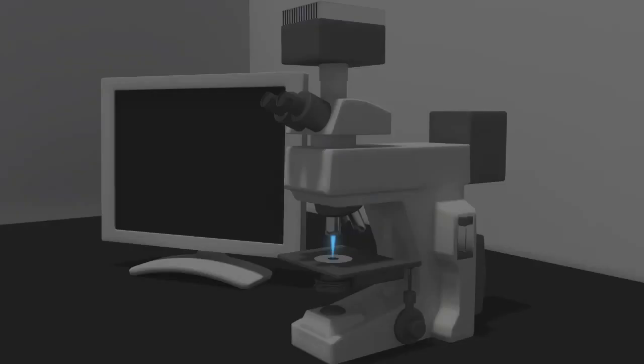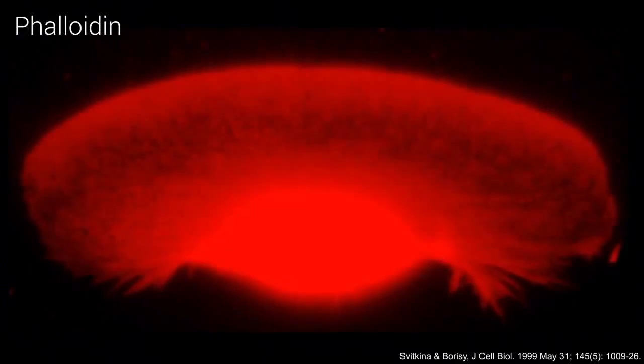Fluorescent microscopy also has many useful applications in the laboratory setting. Fluorescent dyes or stains are used to detect cellular structures. One example of a commonly used fluorescent dye is DAPI, which binds to DNA, and a second example is phalloidin, which binds to F-actin.